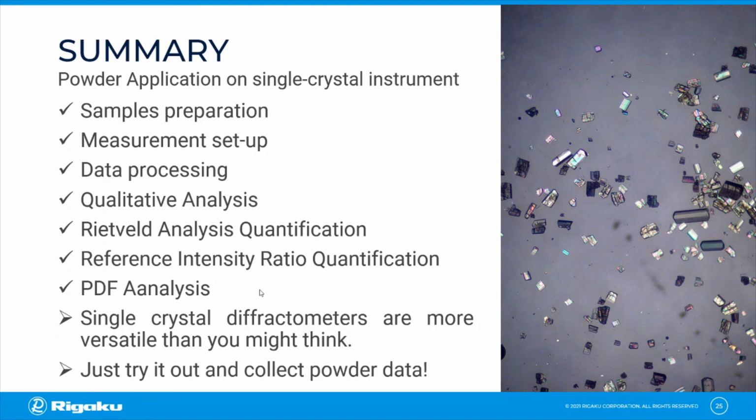I gave you a brief introduction to PDF, pair distribution function analysis. And I would like to summarize that single crystal diffractometers are maybe more versatile than you might think. So just try it out and collect some powder data on your single crystal instrument.